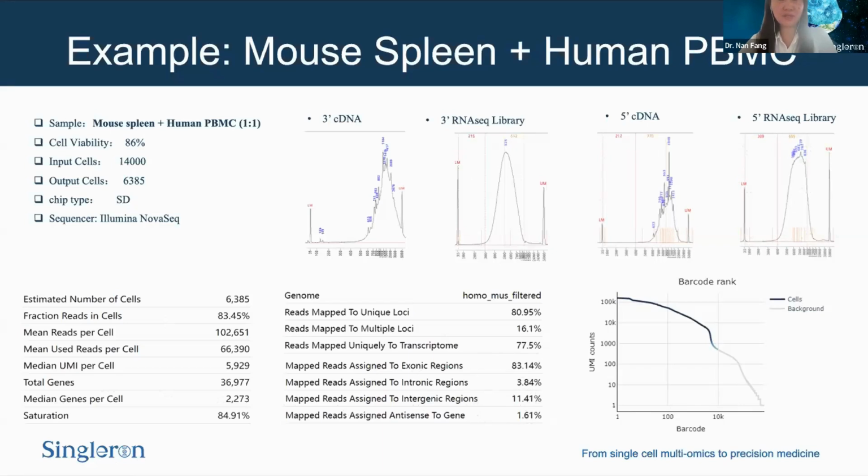And because we really do need to assemble the short reads of those mRNA together to piece together full-length information, this kind of accurate capture of the real mRNA reads is quite essential to start with.